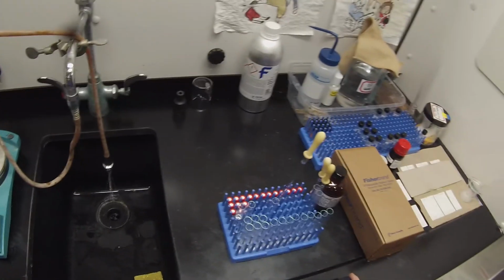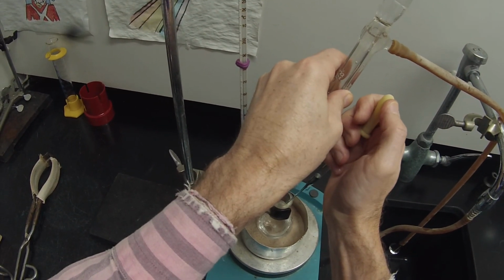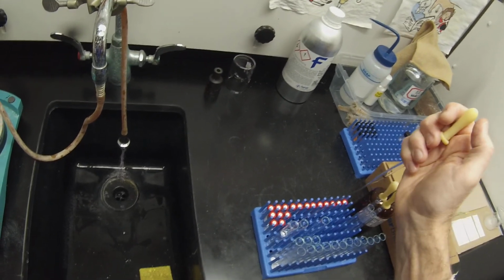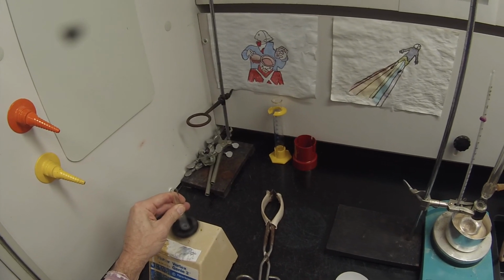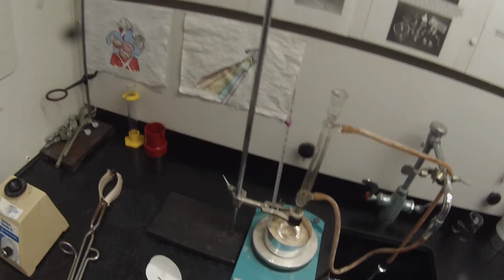And what I want to do is I want to take out a time equals 0 aliquot of my mixture to make sure that the material is not reacting in any way before I add the para-toluenesulfonic acid monohydrate. So we'll just pull that out, reach in there and fill that up to about that line, and add that to our test tube. And just do a quick rinse, a little bit of dichloromethane, set that aside for next time. And then each time what we're going to do is vortex that to mix. I didn't really need to do that this time, of course, because there's no para-toluenesulfonic acid in there. So that's my first aliquot.